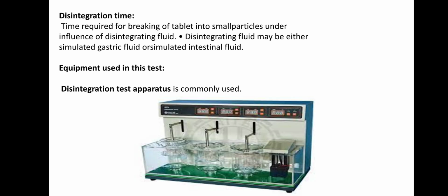Disintegration time: the time required for breaking of a tablet into small particles under the influence of a disintegrating fluid. The disintegrating fluid may be either simulated gastric fluid or simulated intestinal fluid. Equipment used in this test: the disintegration test apparatus.